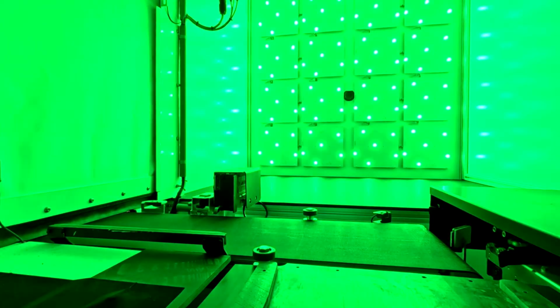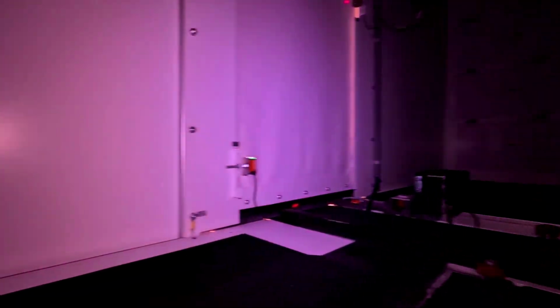In the current example, the imaging cabinet contains a multispectral imaging system where the plants are illuminated in different wavelengths while images are acquired.